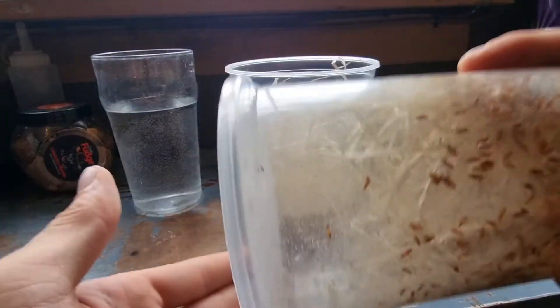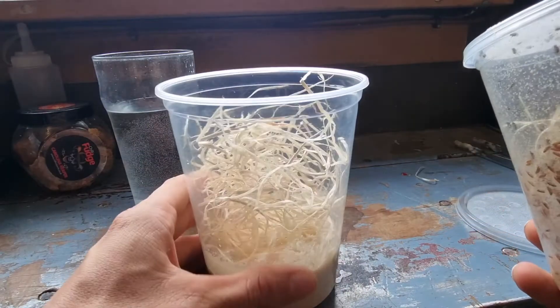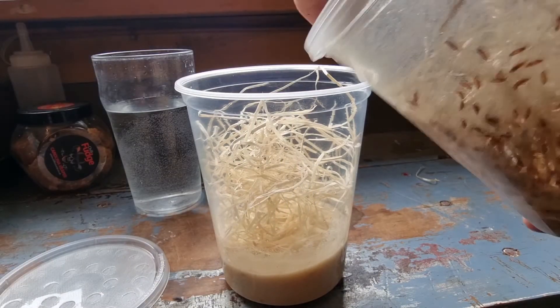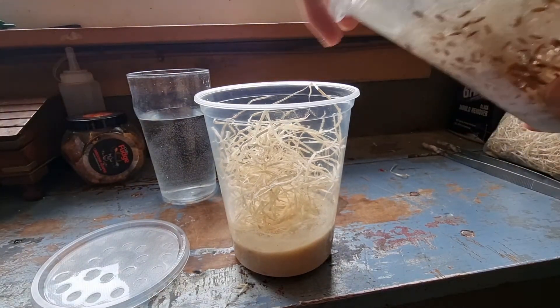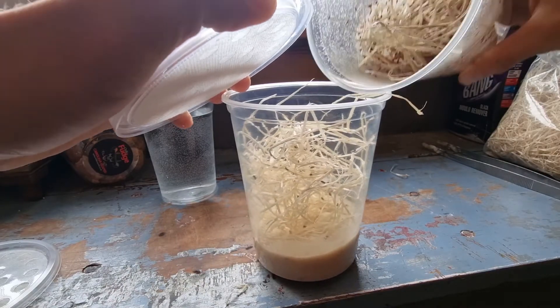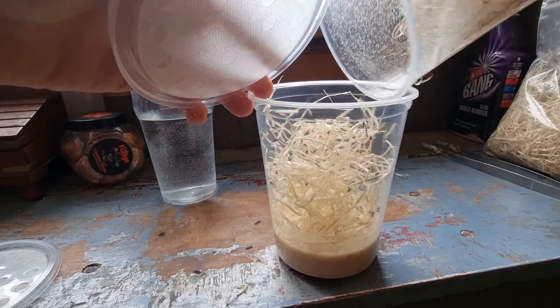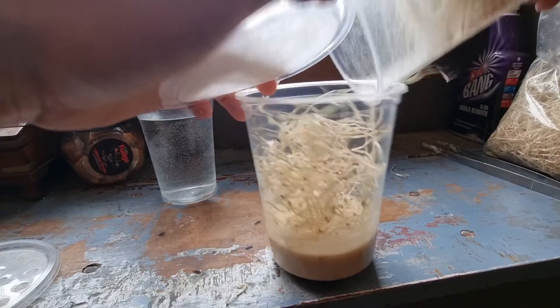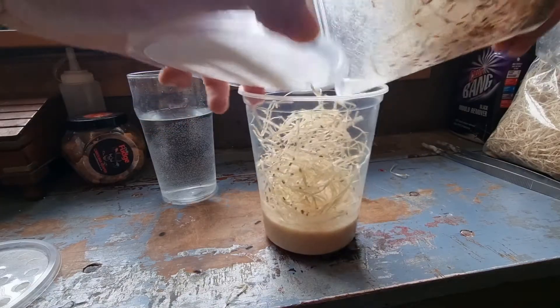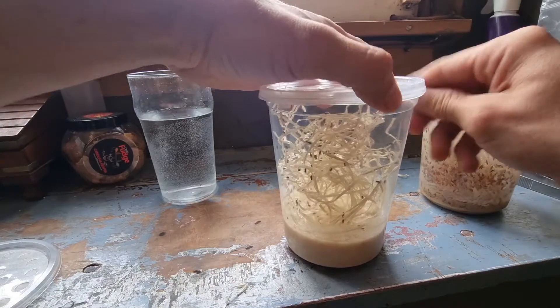This is probably the most difficult part — getting all these little fruit flies into the container. You want about a hundred fruit flies to get a good culture going. The technique is to shake and tap both containers to get the flies moving. You'll get the odd one or two that escapes, but don't let that phase you. When you think you've got as many flies in there as you can, put the lid on.